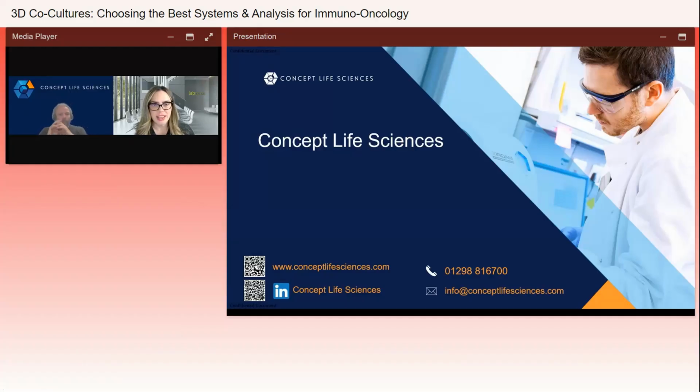All right, great. The next one we have here says, do you need to activate monocytes for them to enter a tumor cell sphere? We haven't had to. They entered on their own quite readily. And when we've used the hydrogels, we've incorporated macrophages directly into that system themselves. So I don't think they necessarily need that. If you want to add activating factors, they will gradually change, and they'll be manipulated directly by the cytokines around them. So I don't think it's strictly necessary, but you can influence it yourself by adding extra things around them.